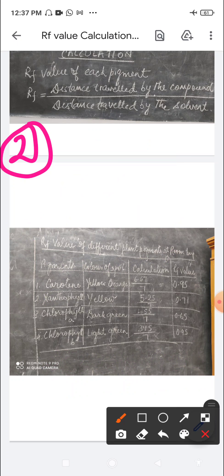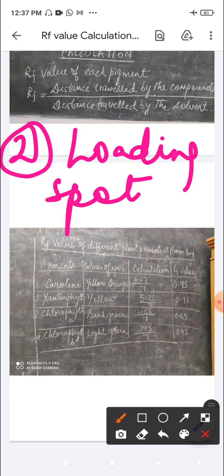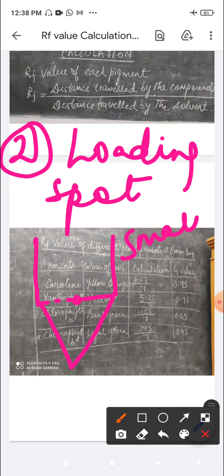The second precaution: the loading spot should be small and concentrated. If this is the chromatographic paper with a notch cut and a line drawn, the loading spot is at the center point. The loading spot should be small and concentrated.